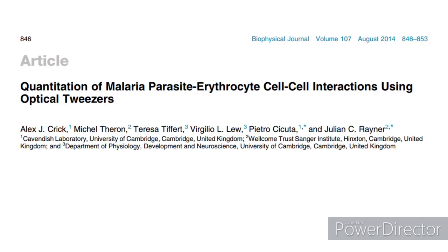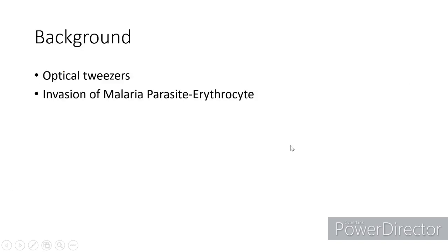This is the article about quantitation of malaria parasite-to-erythrocyte cell-to-cell interaction using optical tweezers. The major author is Alex J. Crick. Here I'm going to talk about the background of optical tweezers and the invasion of malaria parasite to erythrocyte.